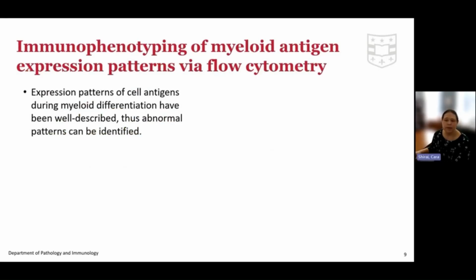Immunophenotyping of myeloid antigen expression patterns via flow cytometry is beneficial in the diagnosis of hematologic malignancies. Cell antigen expression patterns during normal myeloid lineage differentiation have been well described. By knowing what normal is, we can readily identify abnormal cell antigen expression patterns.